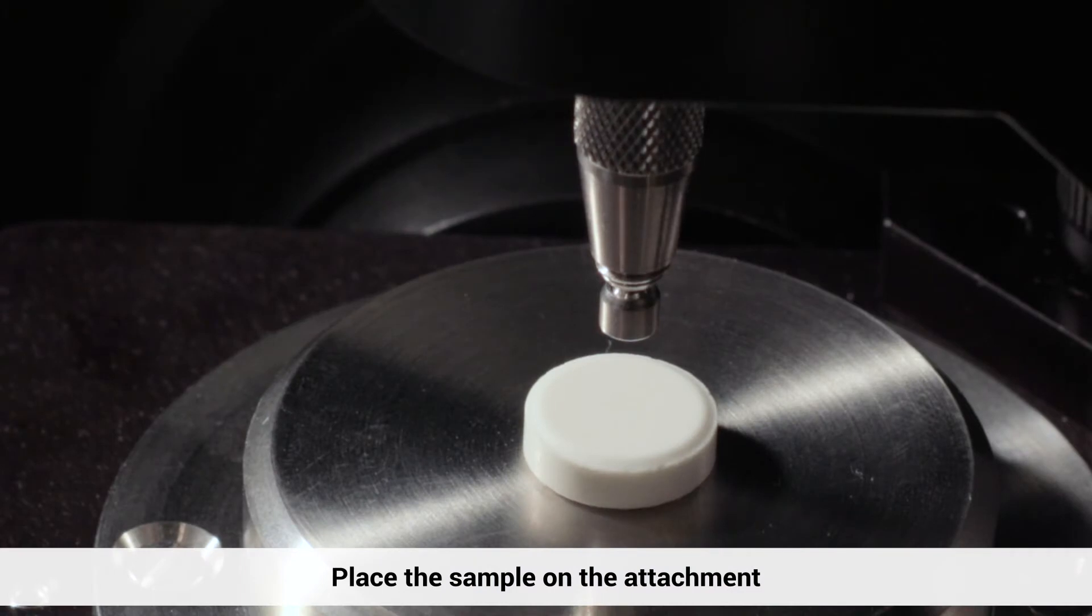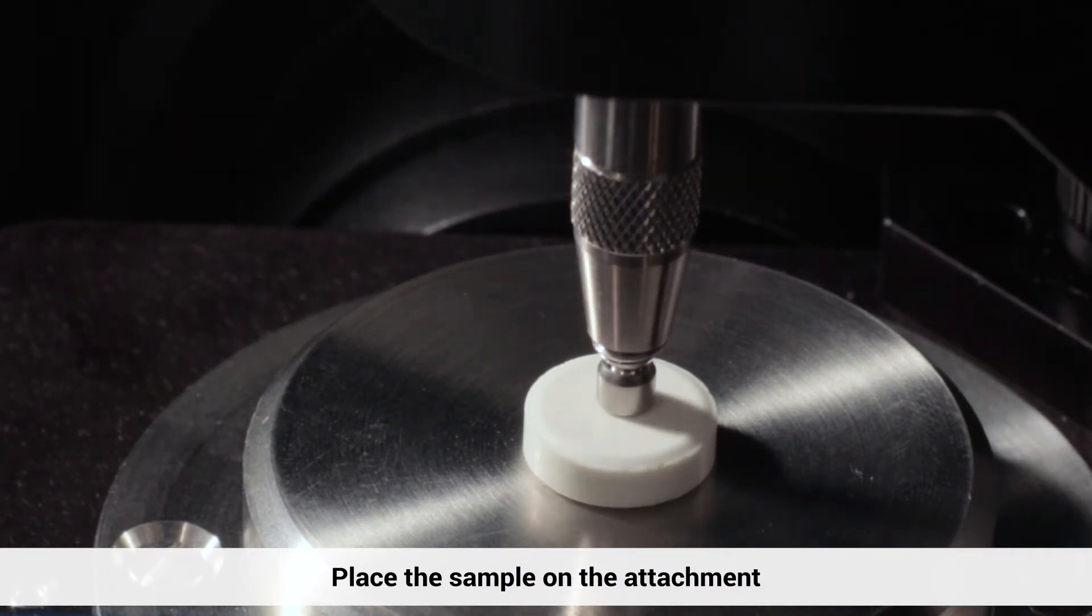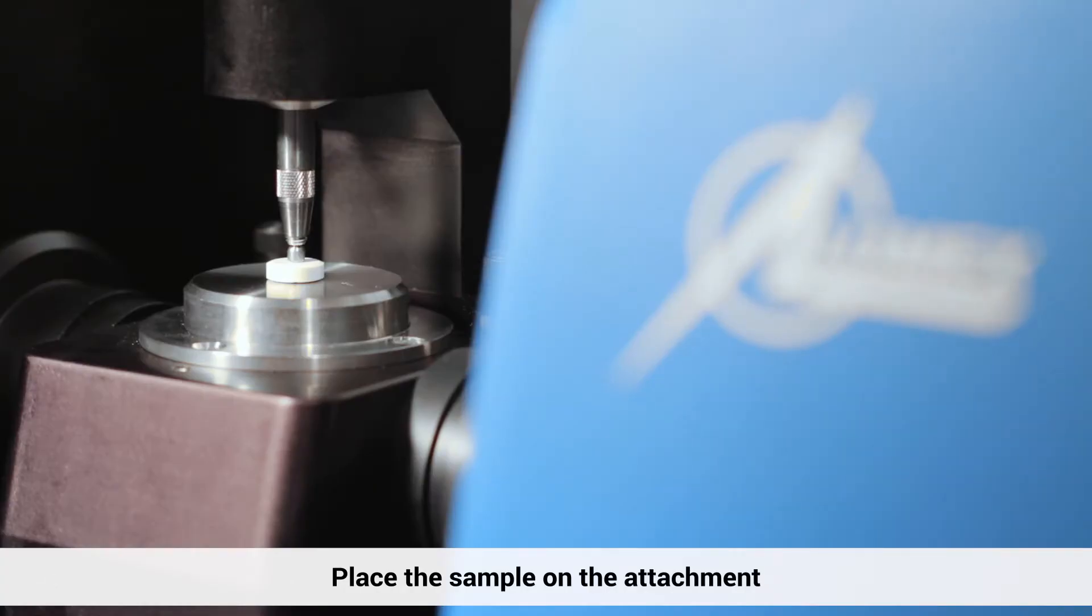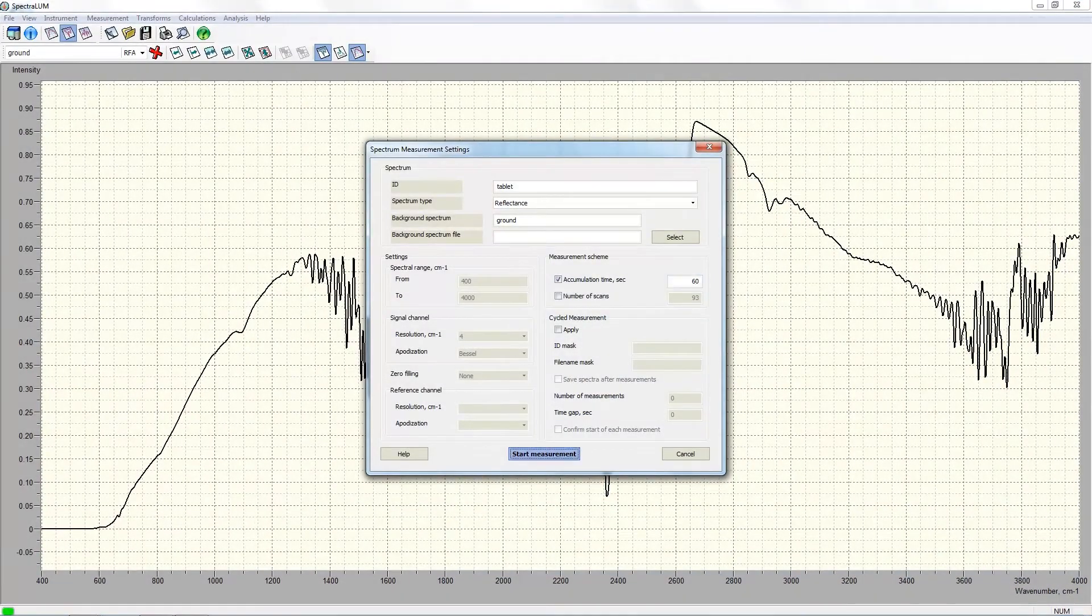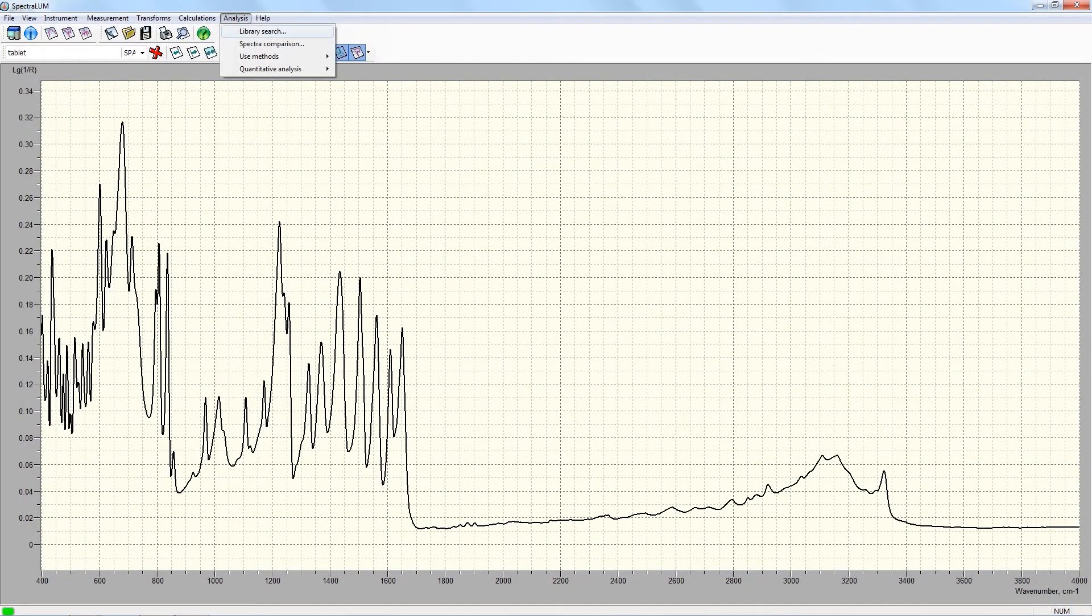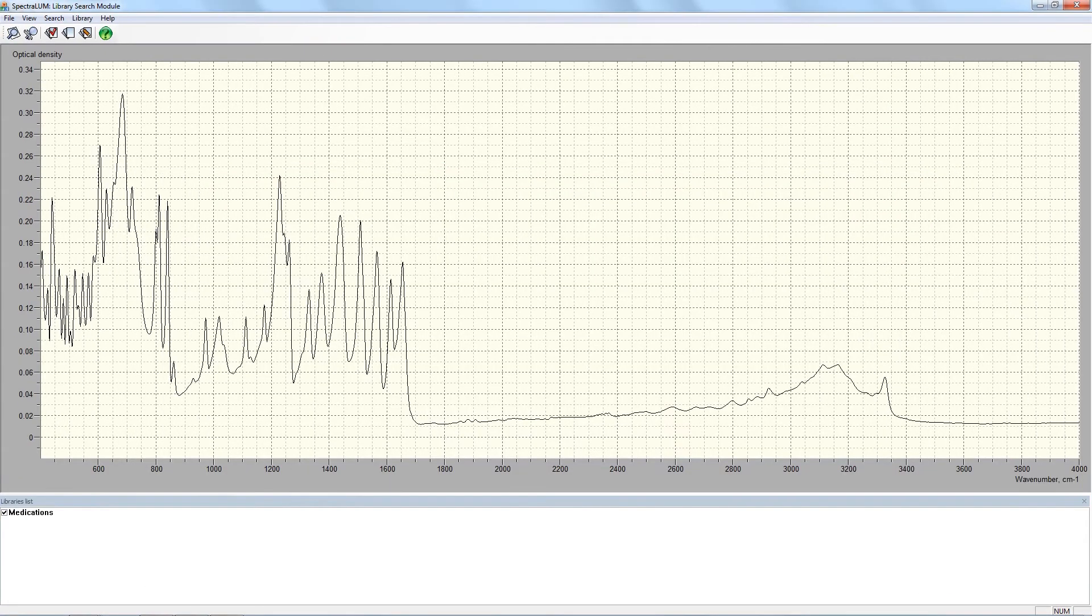Let me show you how simple it is to identify a sample with pre-existing spectra library. We will use an unknown drug as an example. Let's place the sample on the attachment and press start. We launch the measurement.